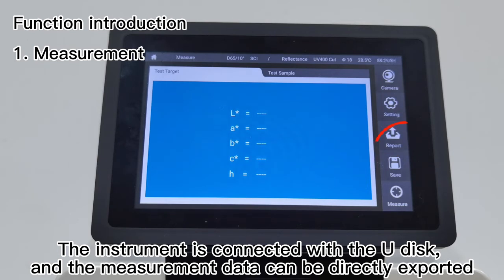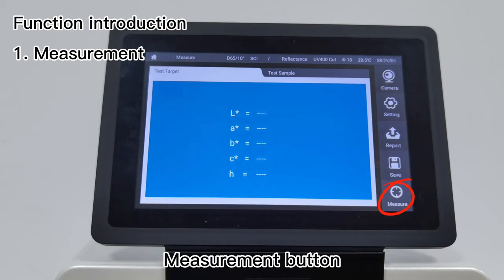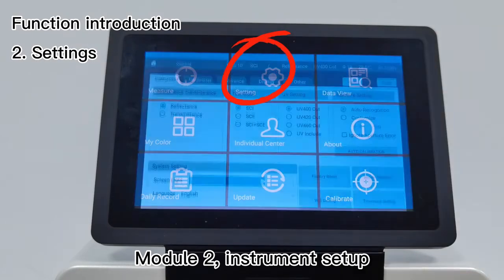The measured data can be saved to the machine using the measurement button. Module 2 is Instrument Setup.